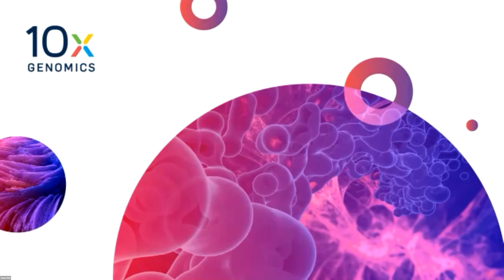Yeah, so I would say there's a lot of different computational third-party tools that are available to do that type of work. Much like with every informatic approach, there are going to be pros and cons, because of the way they inherently build their algorithms to make inferences. Some will just use canonical genes and assign them a semi-quantitative score to suss out the number of cells or the cell types that are there. It's compatible with our data in that if you have single cell data from the same tissue type and spatial data, any one of those informatic tools can be used, and that's what I was showing with some of the papers, where some are using their own in-house tools.